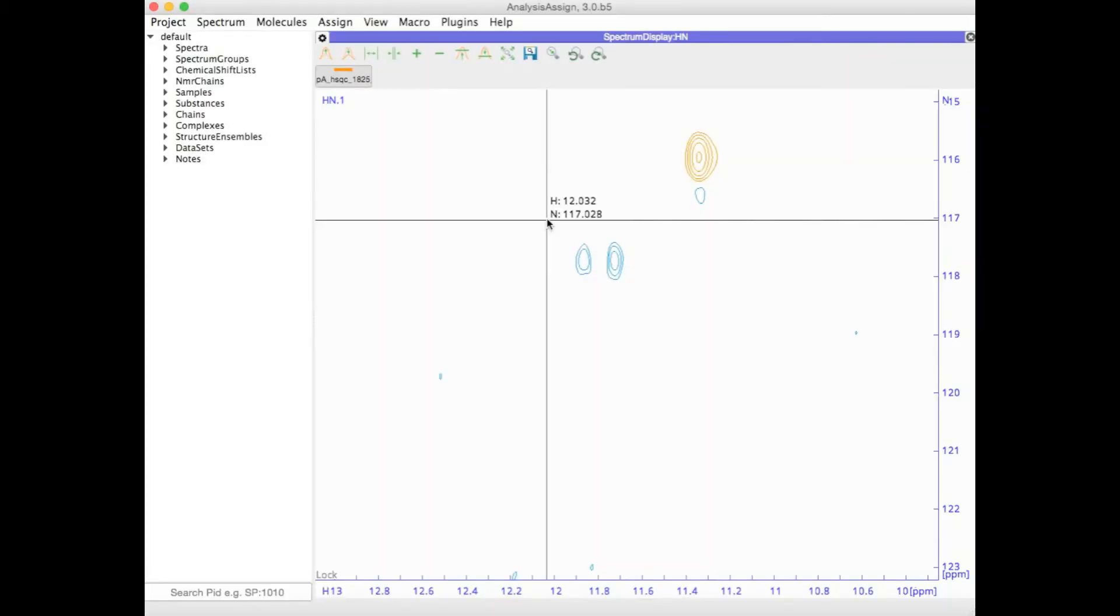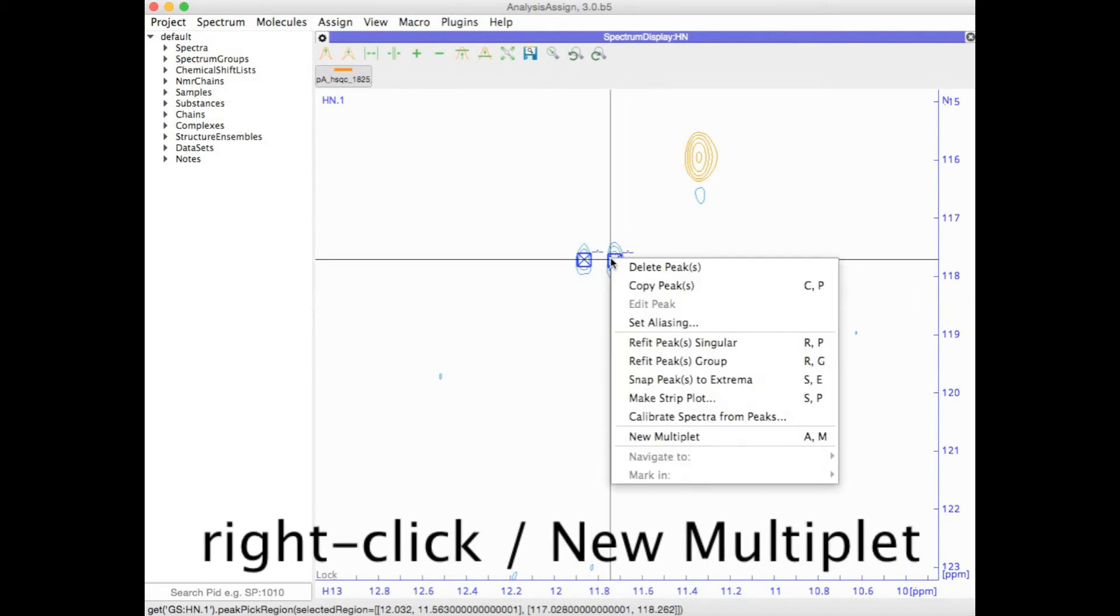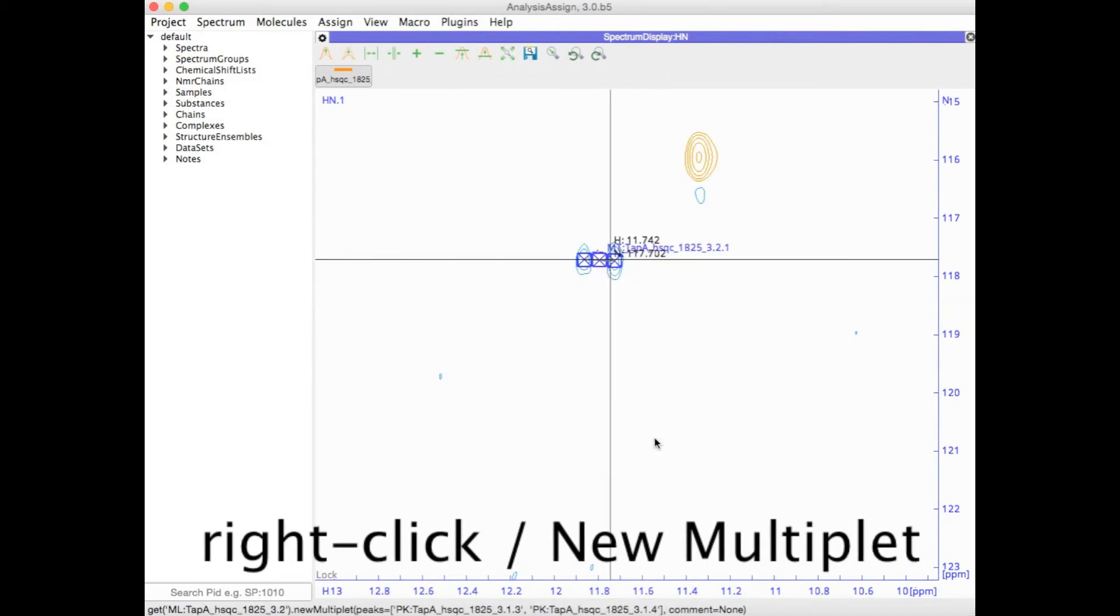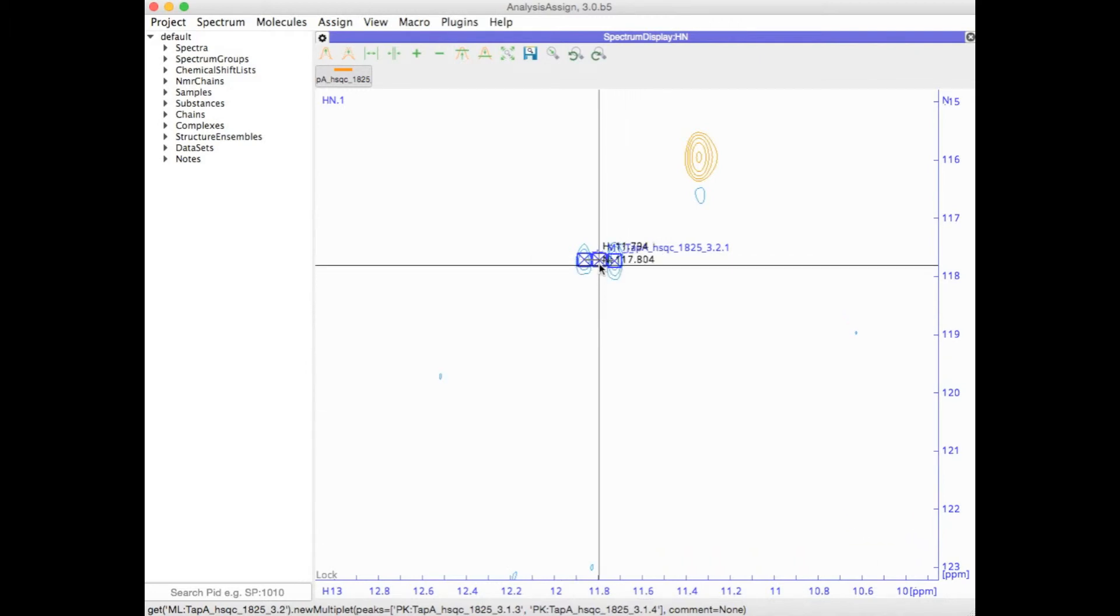Analysis version 3 now has full support for multiplets, whether in 1D or ND spectra. Simply select both peaks and set them to be a new multiplet. Now the chemical shift will be set in the center.